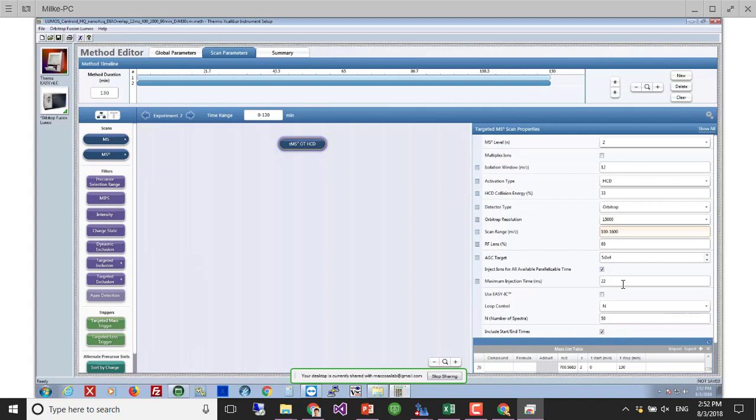That's a clumsy way of saying that, but you can do better with a smaller time and a lower resolution because you can take an additional set of scans. So here, instead of doing 24 m/z wide windows, I actually am running it at 12 m/z wide windows and 50 scans instead of 25 in each duty cycle.